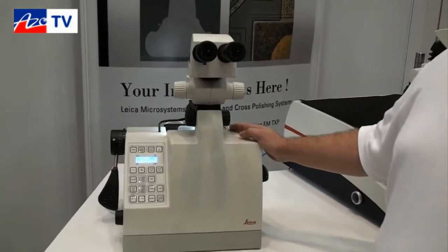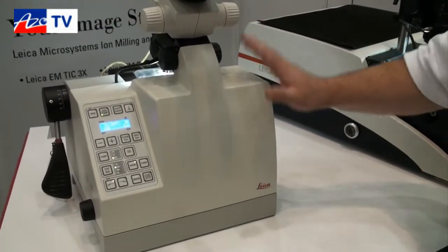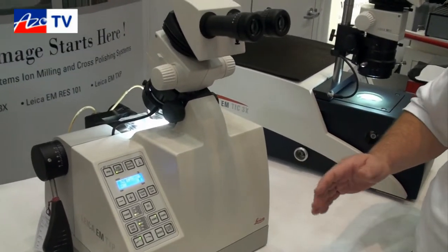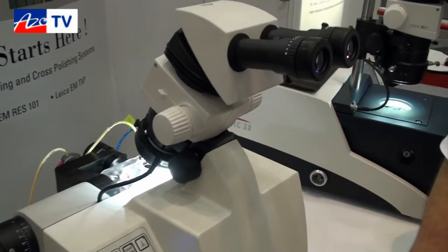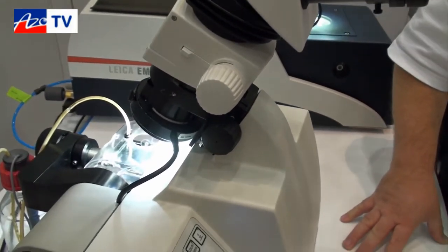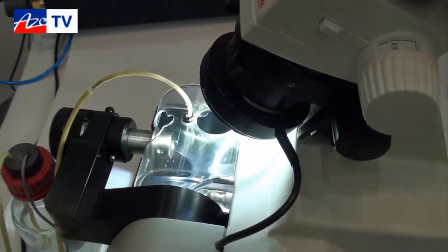This is our EM TXP — this is a mechanical preparation instrument where you can take your samples and mechanically prep, cut, grind, and polish all in one instrument. The traditional way of course is to have a full bench of preparation instruments, but with this instrument we have the observation, the cutting, and polishing done in one instrument. It's very easy to use; you can observe as you're cutting and polishing so that you can actually hit your target with ease, without having to take it out and move it into a microscope and come back.